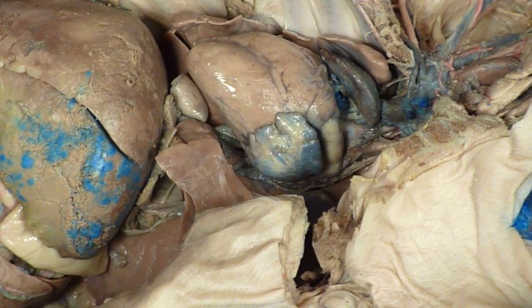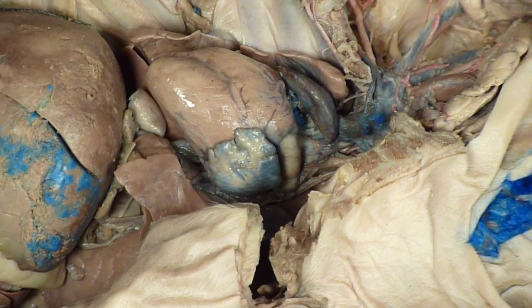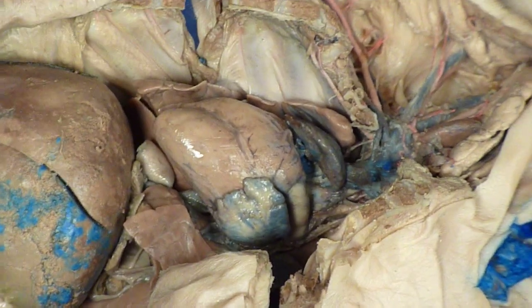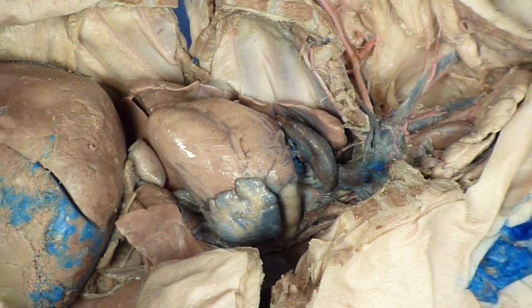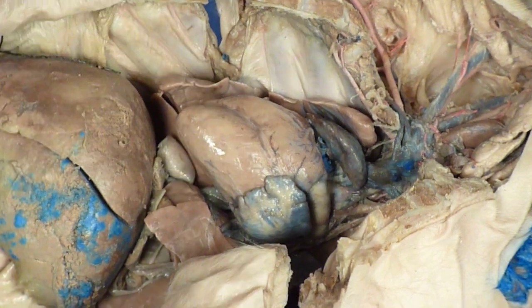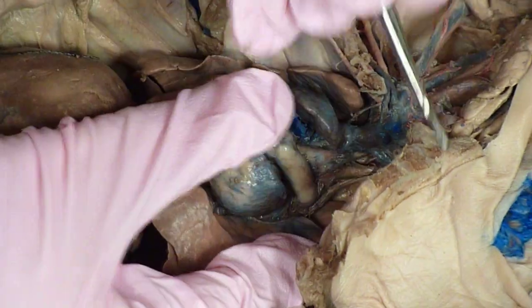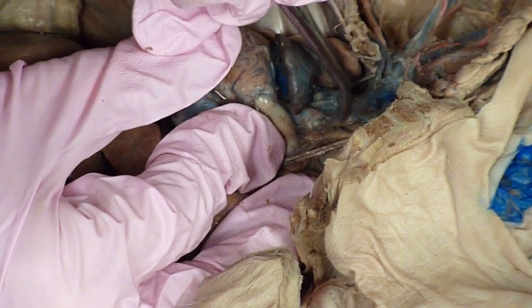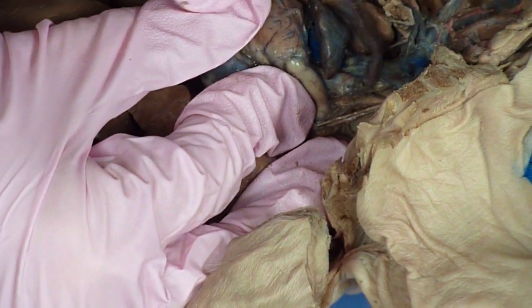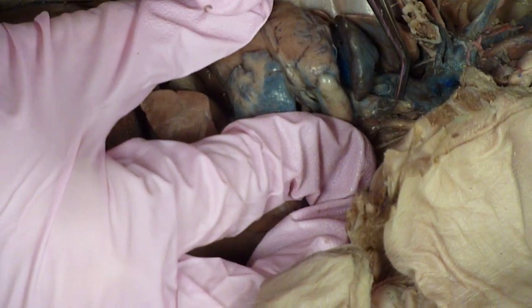In the pig, there are two branches off the aortic arch: the brachiocephalic trunk and the left subclavian artery. In humans, it's different — it's the brachiocephalic, the left common carotid, and the left subclavian. There are three off a human heart. So off the aortic arch you have these two branches — one right there is the brachiocephalic trunk, and that one next to it is the left subclavian.